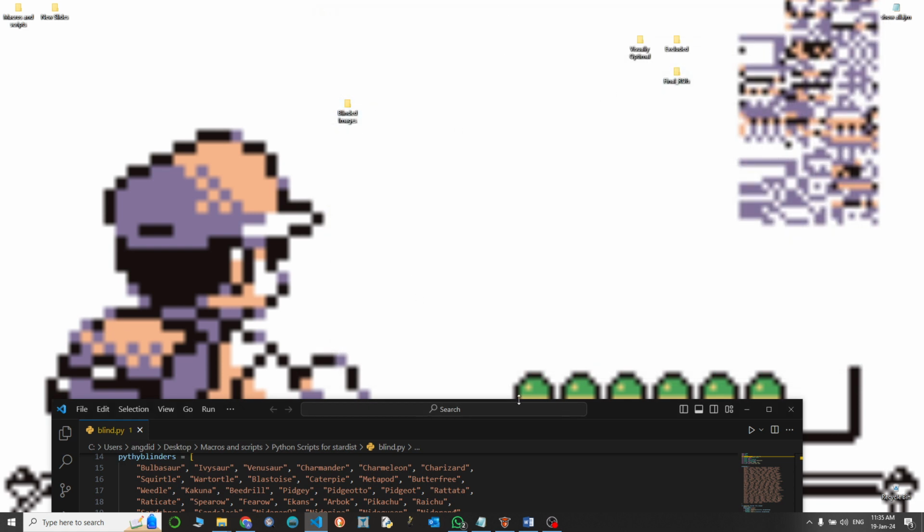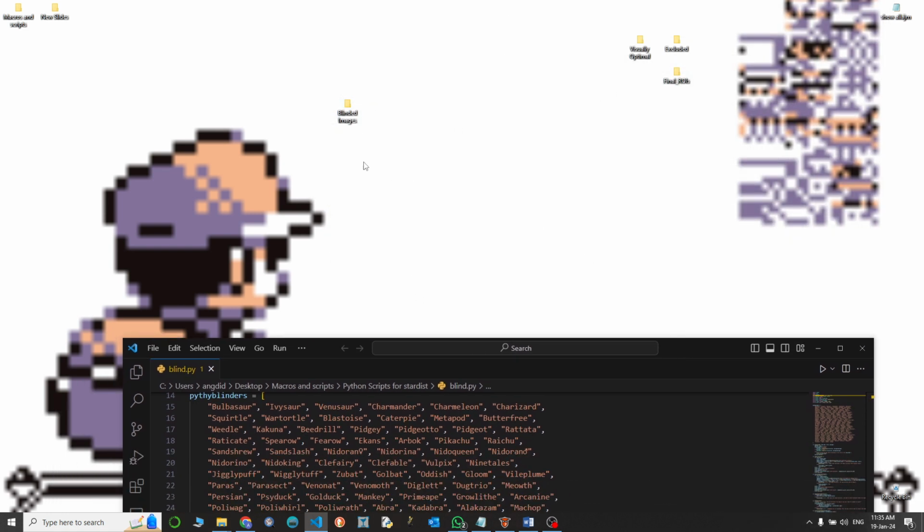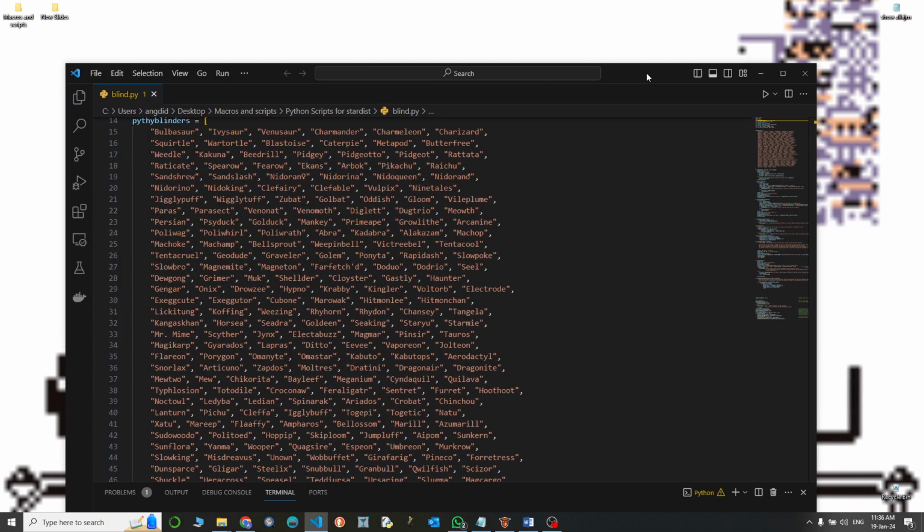And when the time comes to unblind ourselves, by having these right now, you can run step 19 as usual. It's just that you're using blinded files instead. But that's all. Let's do that. But when the time comes, after you run step 19, the manual corrections, and you end up with new folders with zip files and everything, of course, then you want to unblind yourself. How do we do that?